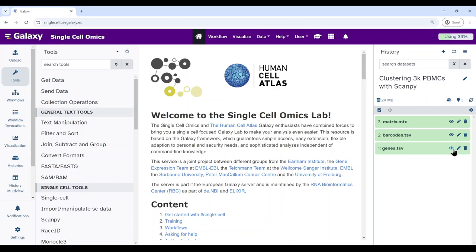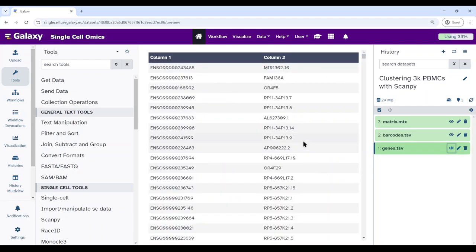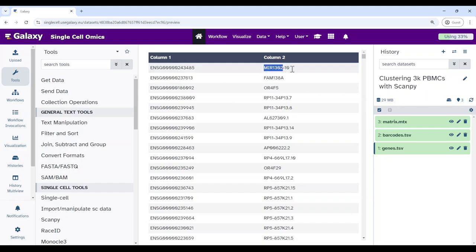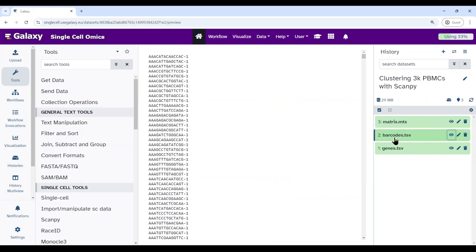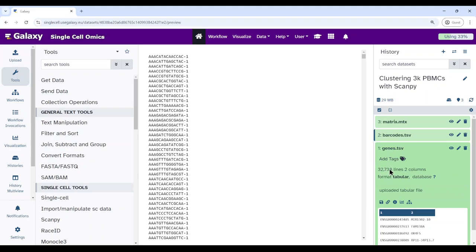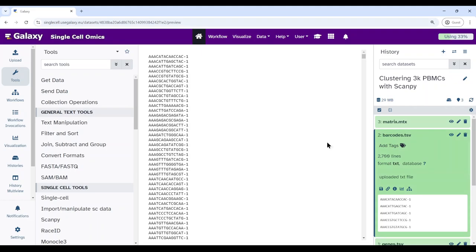Let's quickly look at the data. The genes.tsv file is a two-column tabular file where the first column is the Ensembl gene ID and the second column is the gene symbol. It has 32,738 lines, which is 32,738 genes. The barcodes.tsv file has 2,700 lines — each sequence corresponds to a cell barcode associated with each of the cells in this dataset.